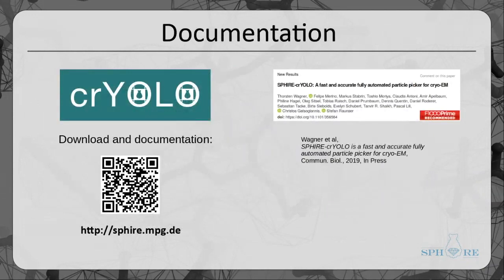So as I already told you, there's a very detailed tutorial how to use crYOLO. You can find it on our website. You can find more technical details in our preprint, and very soon the final paper will be published.